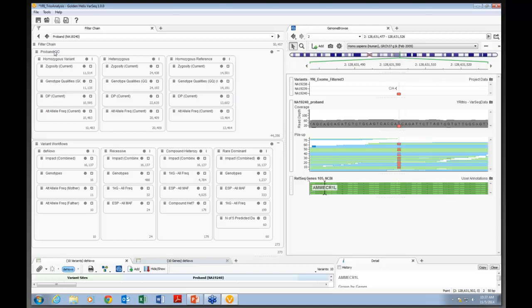What we have here is a set of QC functions that start from 50,000 variants. There are then separate processes for homozygous, heterozygous, and homozygous reference genotypes. Ultimately, there is a certain number of variants that pass through each one, making a union of 44,000 variants. Those 44,000 that passed QC get passed to the next step down vertically. So side by side indicates OR logic. Vertical stacking indicates AND logic, or intersection logic.